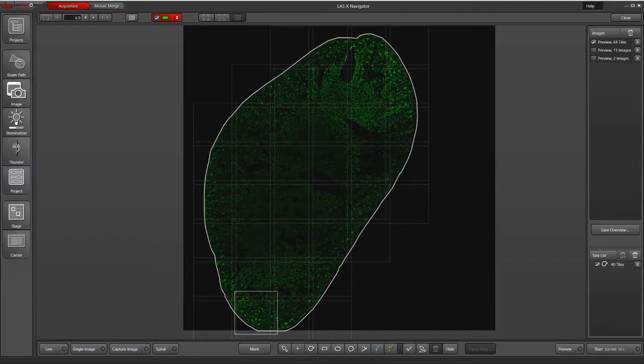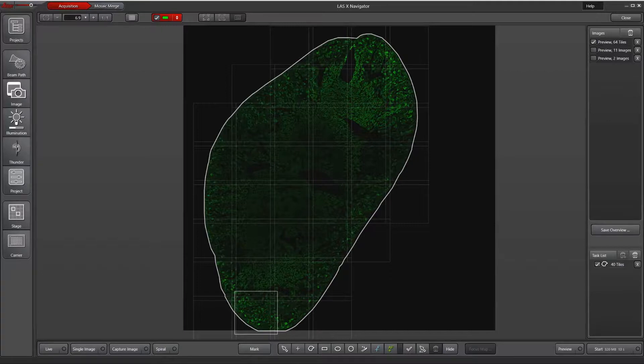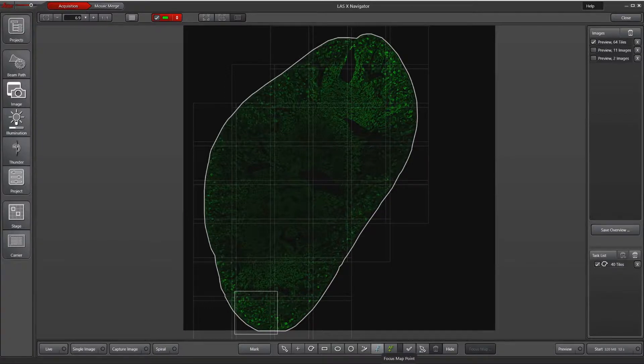I've already done a preview and used the magic wand tool to outline the region of interest. If you would like instructions on how to do that, please check out our other tutorial called LASX Navigator Quick Start. To set up a focus map, I'm going to go down to the bottom of the screen and hit the blue plus F button to allow me to designate focus map points.